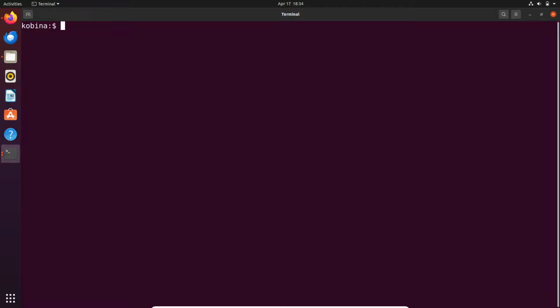So on the terminal, what I'll do is to create a directory, a working directory, right? I'll say mkdir fastq_files, and then I'll cd into that. Let's do an ls to make sure it's empty. Let's clear the screen. Okay, and then we can proceed. You can also do a pwd to see where you are. That's fine. I always advise you do that, right? Now that's what we are going to do.